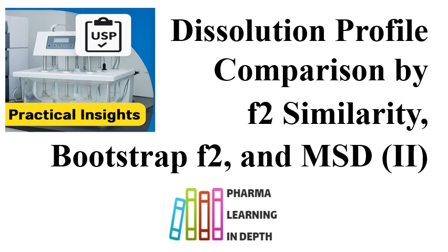So if there are some SUPAC changes, if there are certain variations in the formulation composition, API, manufacturing process, and some other things, then dissolution similarity is required to be demonstrated. So F2 similarity or F2 factor calculation, bootstrapping F2, and MSD methods are used.